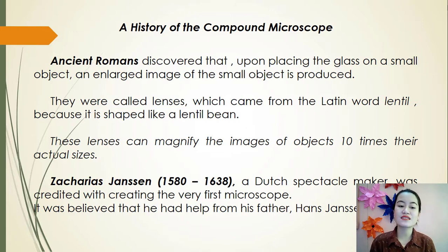Next we have Zacharias Janssen. So who is this Zacharias Janssen? Zacharias Janssen is a Dutch spectacle maker, credited with creating the very first microscope. Si Zacharias Janssen ay kilala sa kauna-unahang gumawa ng microscope. It was believed that he had help from his father. Nakita at lumabas na kasama niyang gumawa ay yung kanyang tatay, which is Mr. Hans Janssen.